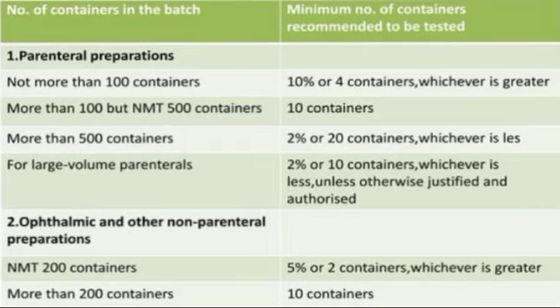Second, ophthalmic and other non-parenteral preparations: not more than 200 containers, 5% or 2 containers, whichever is greater. More than 200 containers, 10 containers.